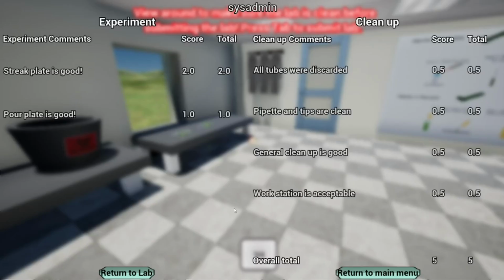So I hope you guys can follow this tutorial and get perfect scores as well. And if you note any problems, just feel free to reach out either in the comment section or just email me, and I'll try to fix any mistake or any bug that you found, or try to guide you in an alternate way. So that was a nice little walkthrough of our controls lab as well as our lab 1.